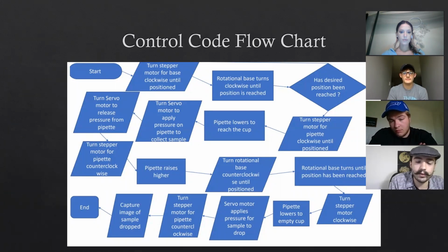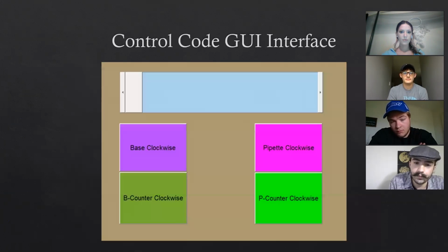And this is a general flow chart, as we can see. This was the final GUI interface that was practically managed to be controlling the sampler stand and the whole process.